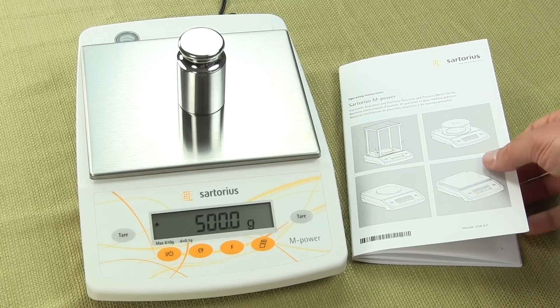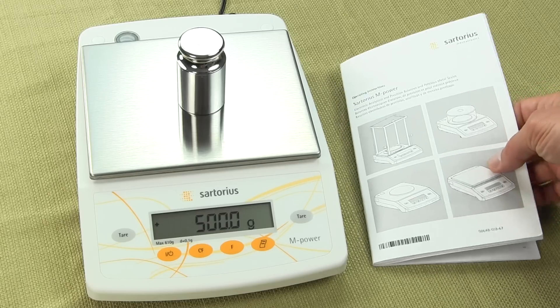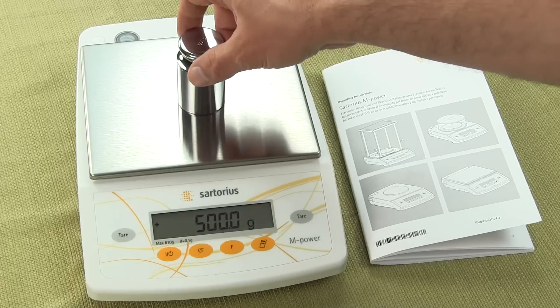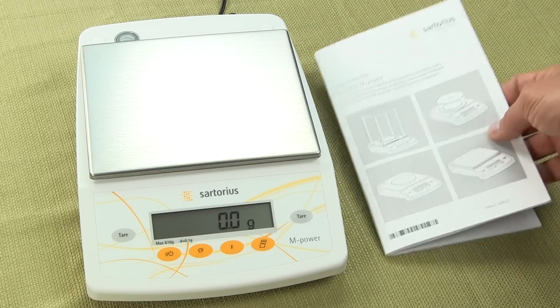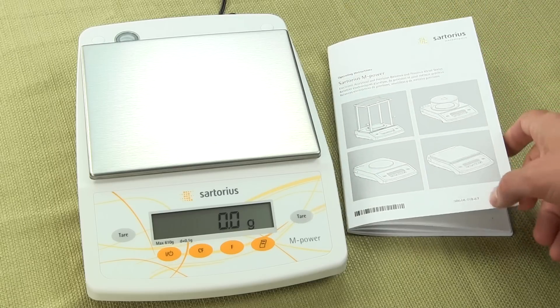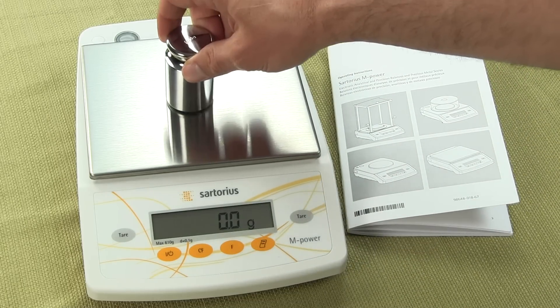Today we're going to be showing you the Sartorius M-power scale. This particular model is the AZ601. The scale comes standard with an AC adapter, manual, and scale. Calibration weights are optional.